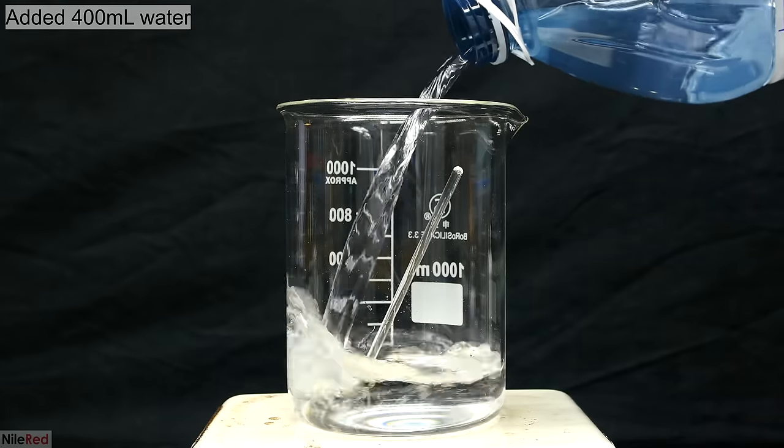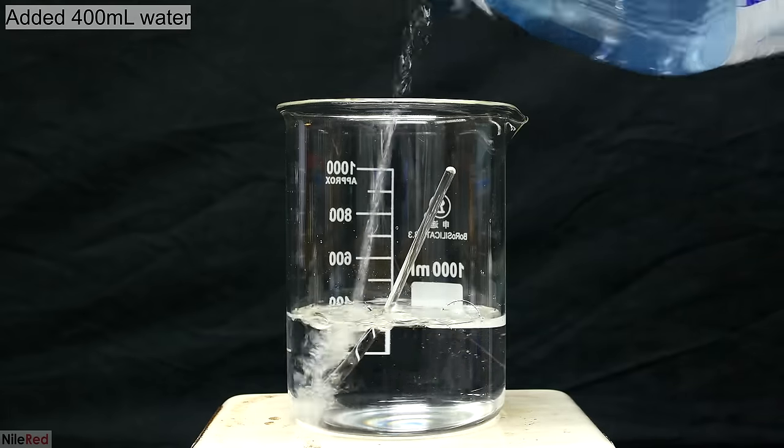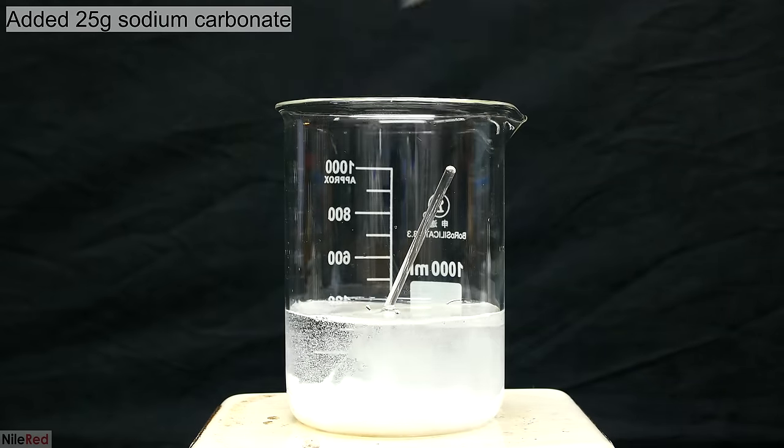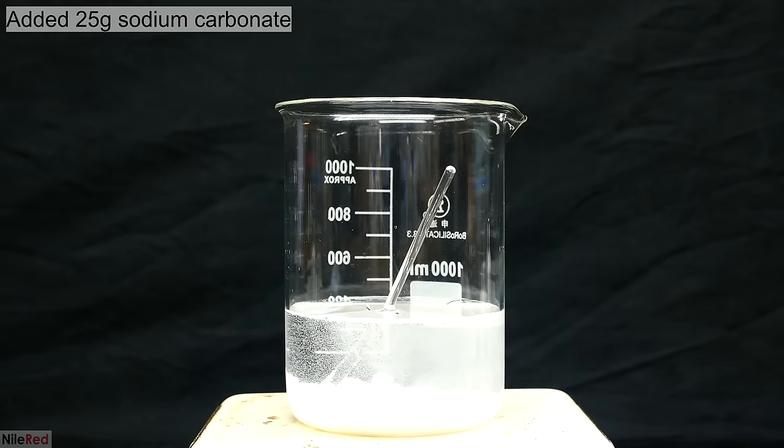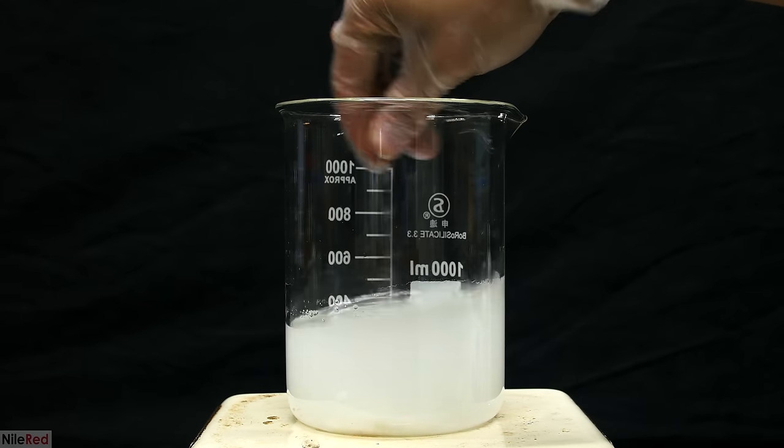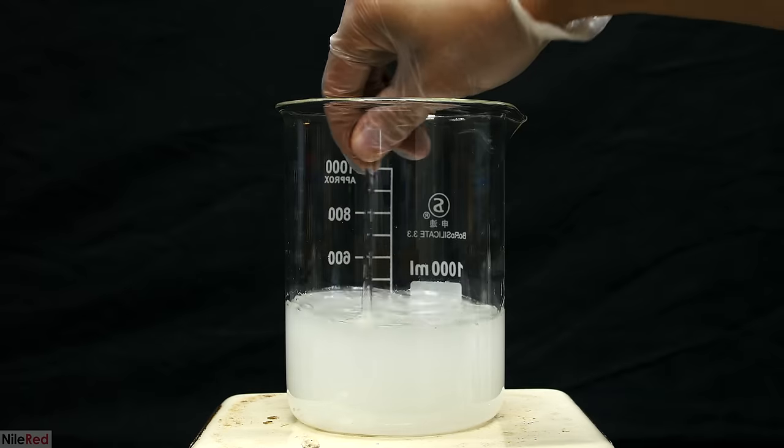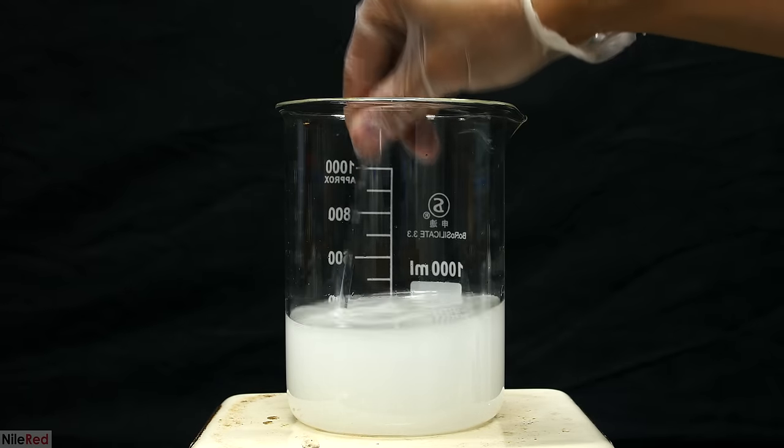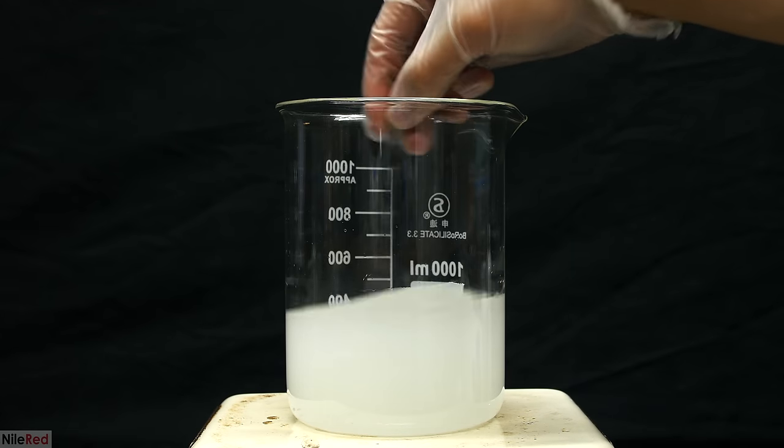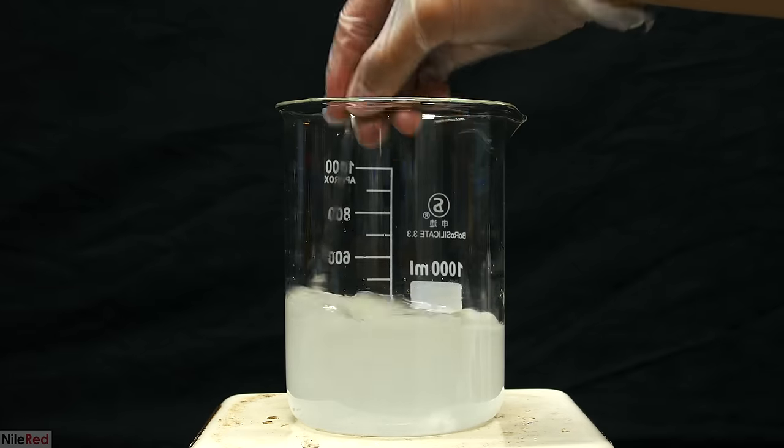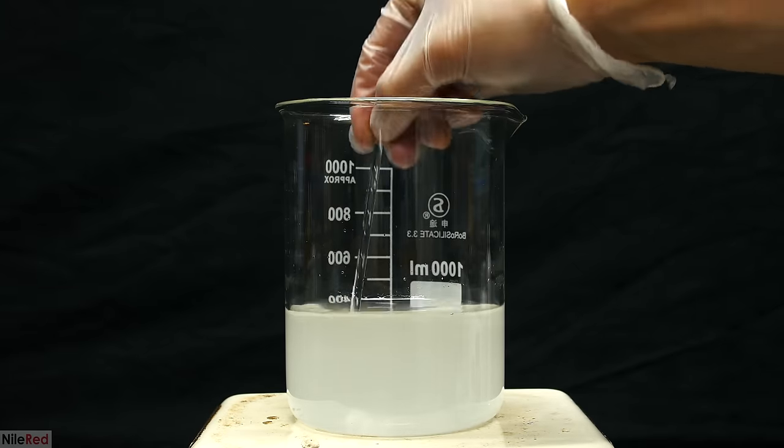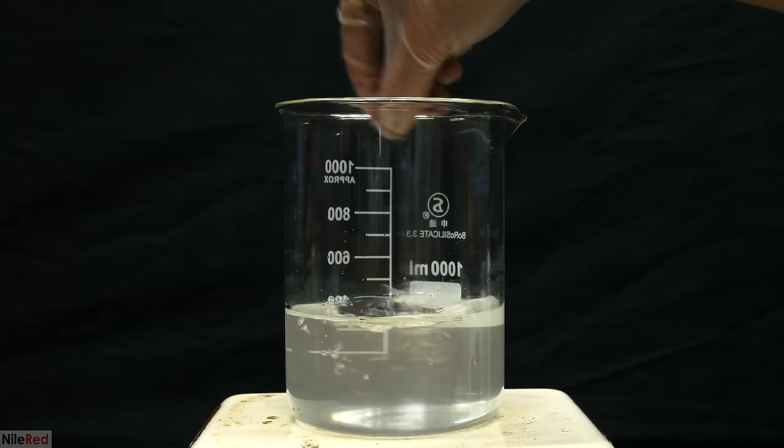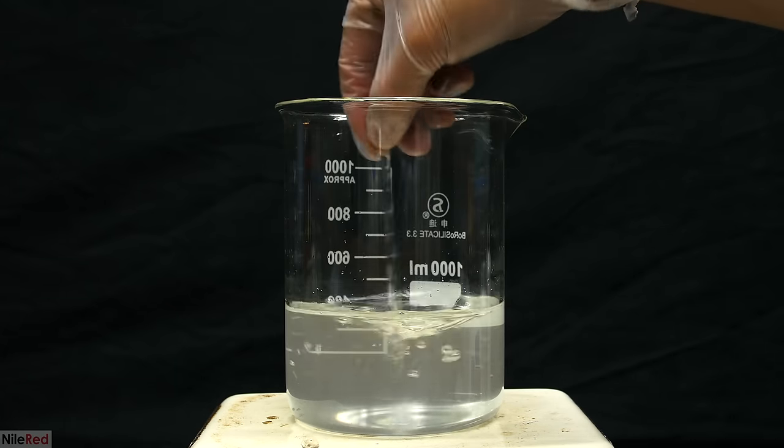To start things off I add 400 milliliters of distilled water to a beaker. To the water I added about 25 grams of anhydrous sodium carbonate. Using a glass stir rod I mix things around until everything has completely dissolved. At the same time I turned on the hot plate and heated things up. Heating helps dissolve the sodium carbonate, but it's also needed for the next step to work. I'd say something around 90°C is good.